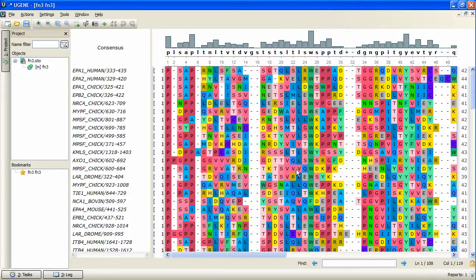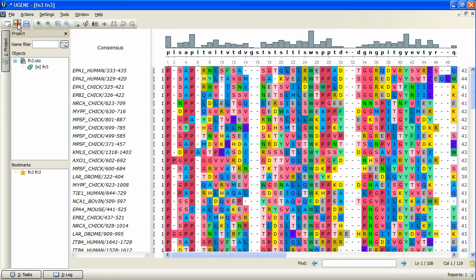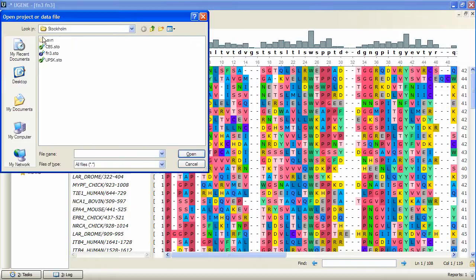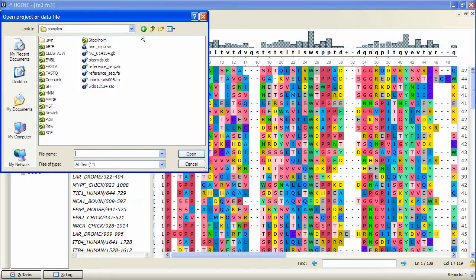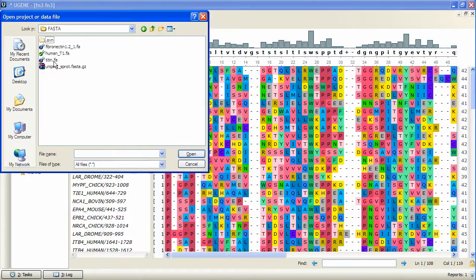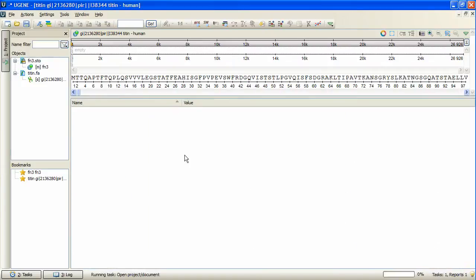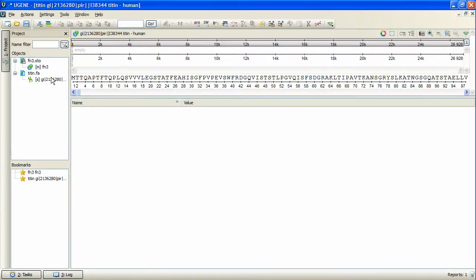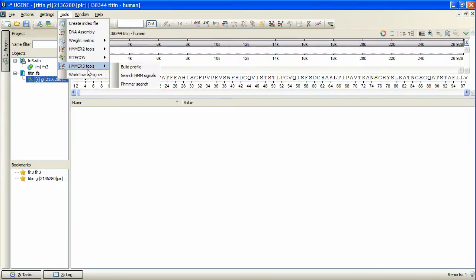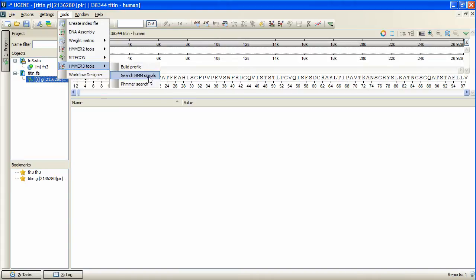Now we can search for the homologues using the created profile. To do so, the sequence to search in must be opened in the project. Let's open this sequence. When the sequence is selected in the project or opened as a view, we can go to the Tools, HMMER 3 Tools menu again and activate the Search HMM Signals menu item.